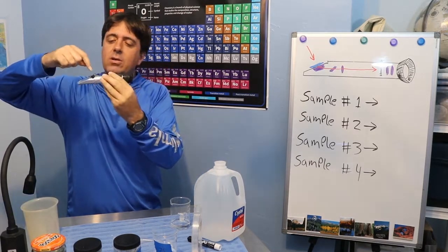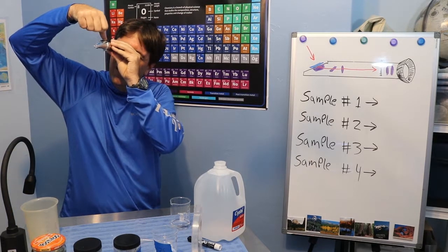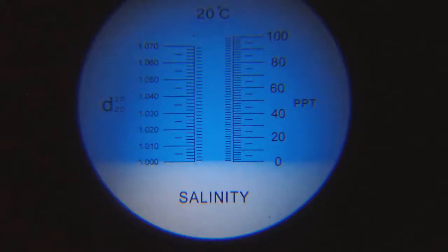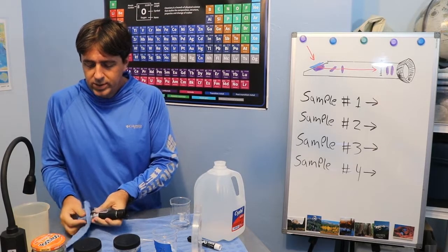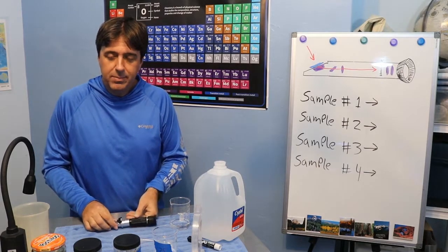So I have the little calibration knob there. It's great for a little fingernail or a small screwdriver, and I'm on 0. So it is now calibrated, ready to go. So I can just rinse off my faceplate and we can begin with our samples.